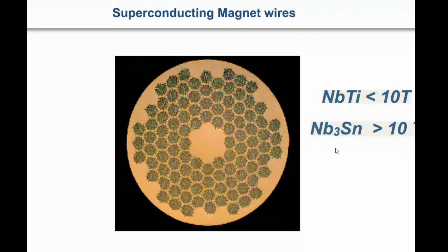Oxford had it, I guess, which was then given to Bruker. Then JEOL has it. Varian used to have it. I think Varian and Bruker basically got it from Oxford, and they are probably developing it for much higher fields. These are the companies who make high-end magnetic fields.